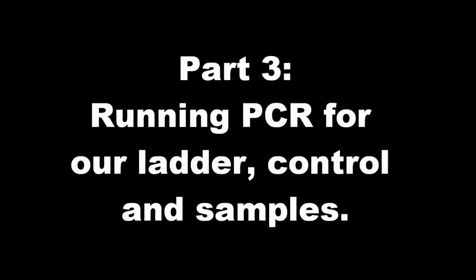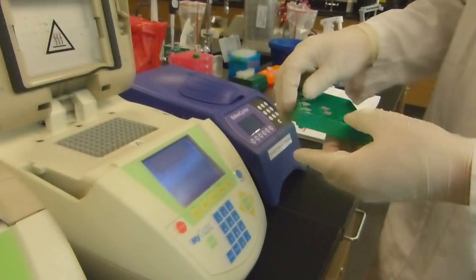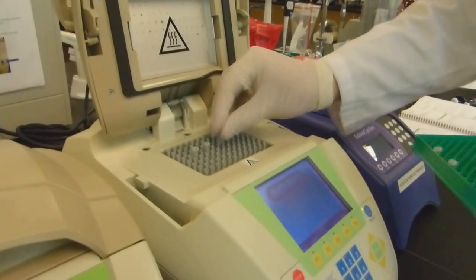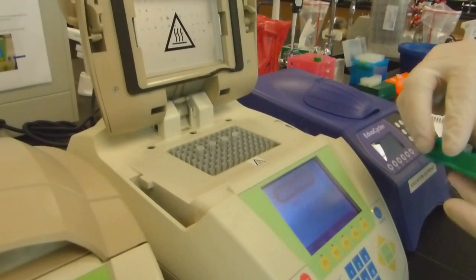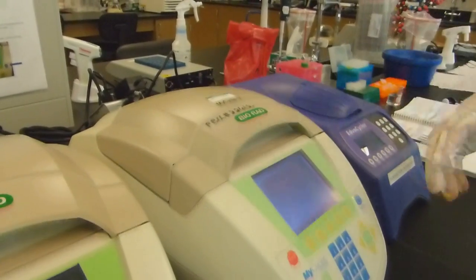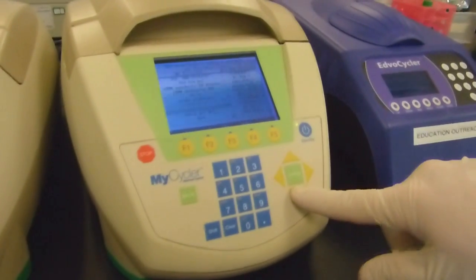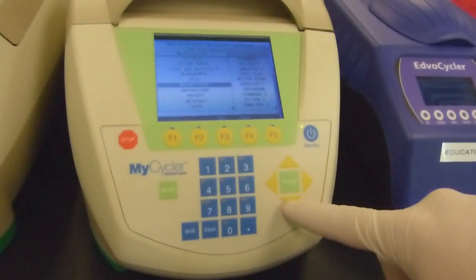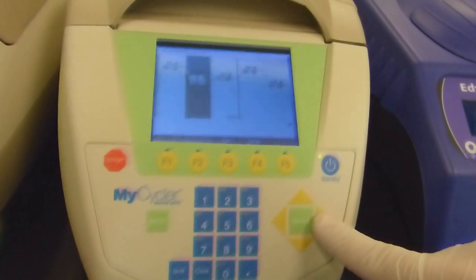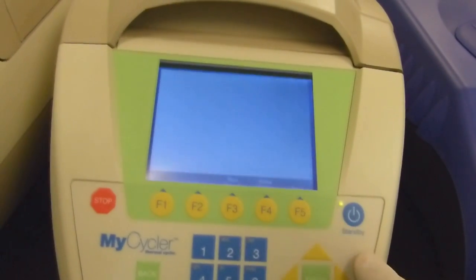If you want to feel like a real biotechnician, now is the time. We are about to perform a technique known as PCR, polymerase chain reaction, something only dreamed about a few decades ago. Each reaction tube will be heated and cooled in sequence for 40 cycles until billions of copies of target nucleic acids are produced. All of the cycling protocols we use are pre-programmed in the thermal cycler. If they weren't, it is easy to add one, but in this case, we simply scroll down to select it. Viewing the protocol shows us the target temperatures and the number of cycles that will be run.